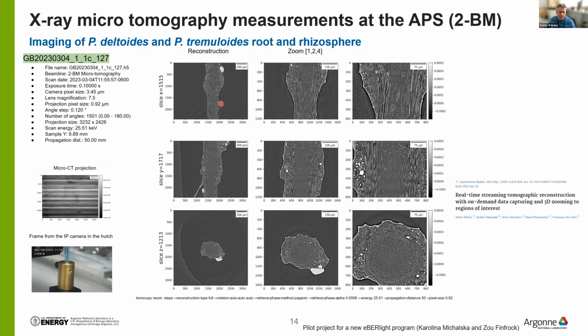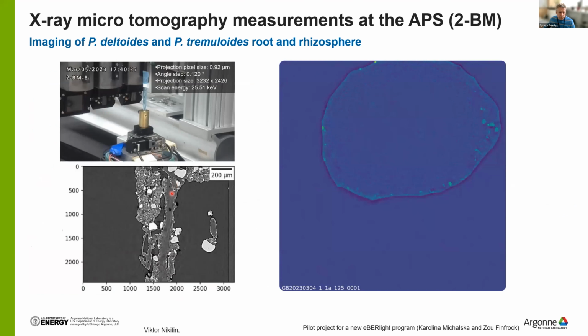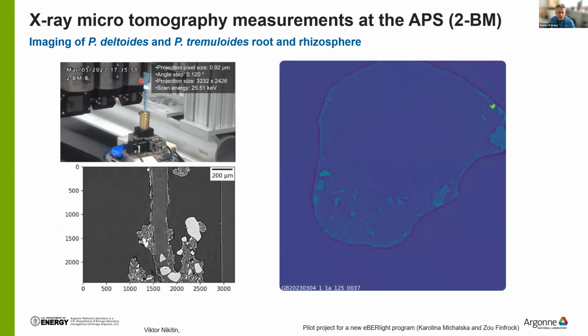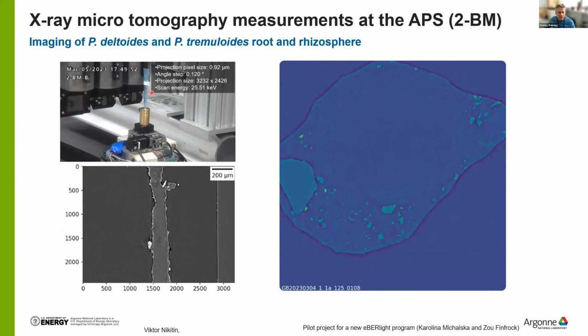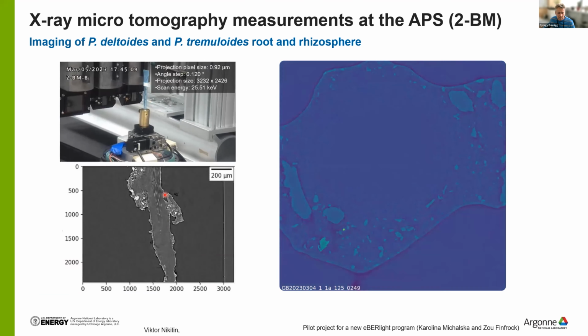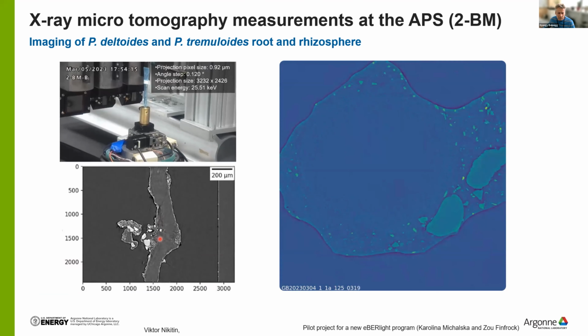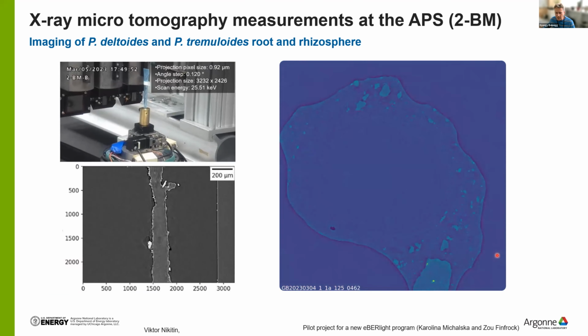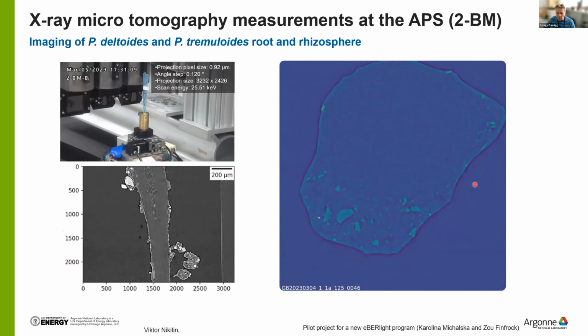So what you see here is that root piece section that's about 2 millimeter in height, and then the attached soil aggregates. So we're able to look at a sample that was enclosed in a pipette tip. And so we can actually follow through a larger section to see what the soil aggregation is around a root, and this is just zooming through those Z slices there.